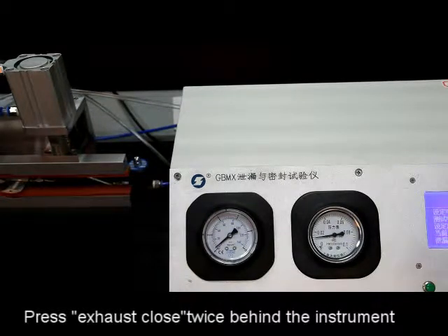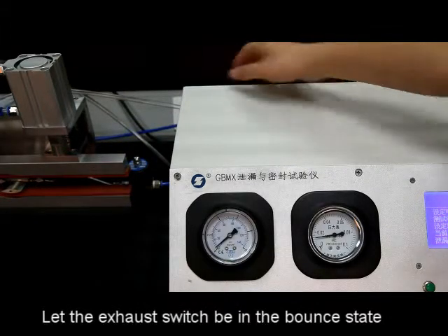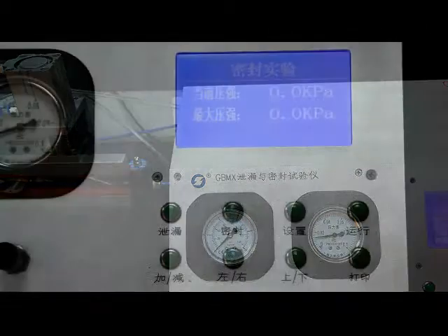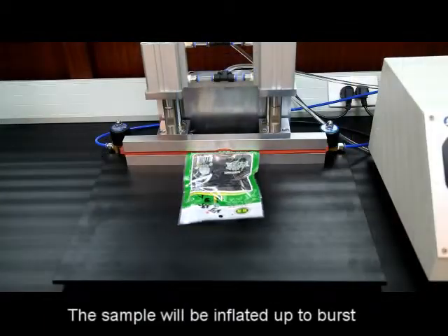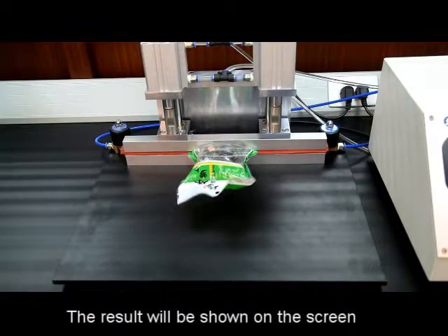Press exhaust close twice behind the instrument to exhaust the inner pressure. Let the exhaust switch be in the bounce state. Press start. The sample will be inflated up to burst. The result will be shown on the screen.